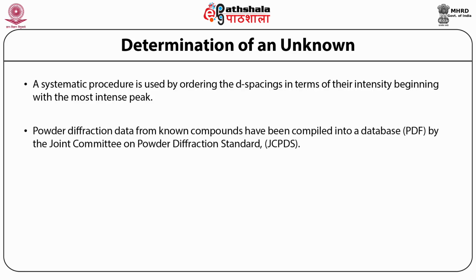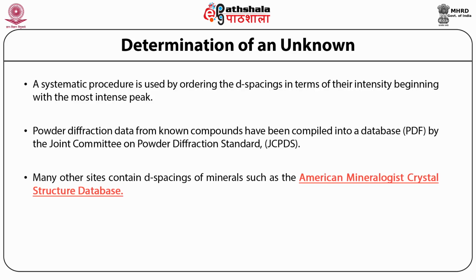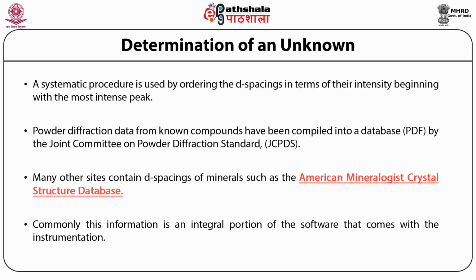Powder diffraction data of the known compounds have been compiled into a database by the Joint Committee on Powder Diffraction Standards. Many other sites contain d-spacings of minerals, such as the American Mineralogist Crystal Structure Database. Commonly, all this information is an integral portion of the software that comes with the instrumentation.